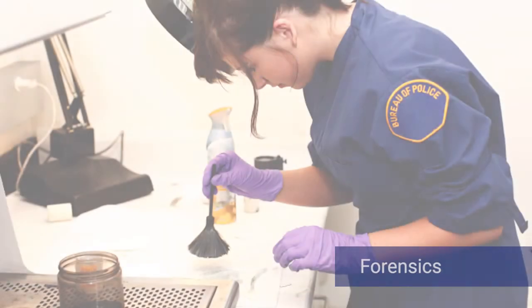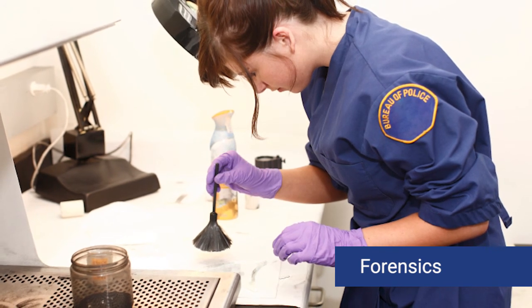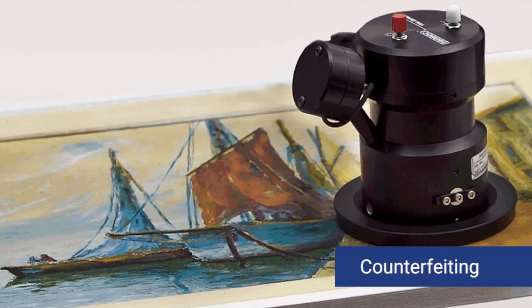So when would people use diffuse reflectance of a solid or of a powder? Well, for product uniformity. Sometimes for counterfeiting. See if the colors are from one manufacturer to another, or from the counterfeiter to the manufacturer.